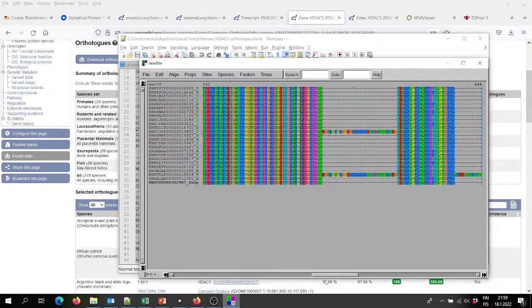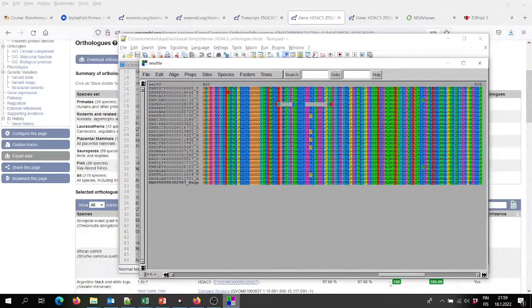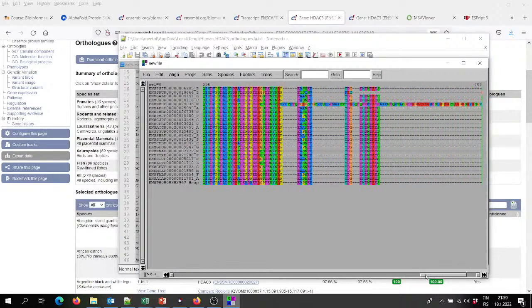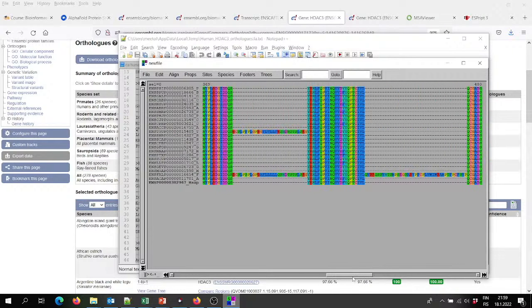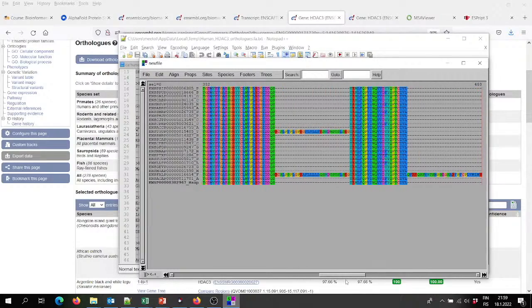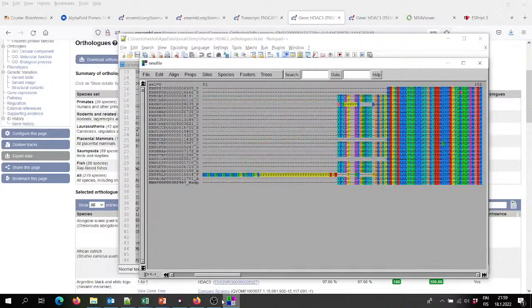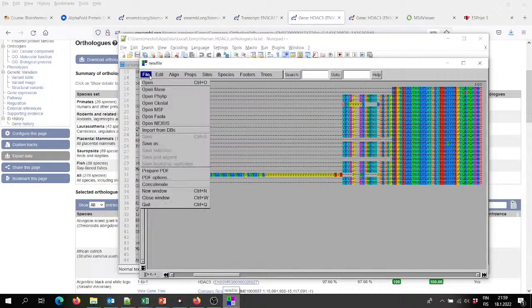This is super highly conserved, so it seems there are hardly any differences there. And then some sequences have odd looking insertions. They could be retained introns, which are problems in the gene prediction, or maybe they are real insertions, hard to tell. But anyway, the sequences were technically very simple to get there.